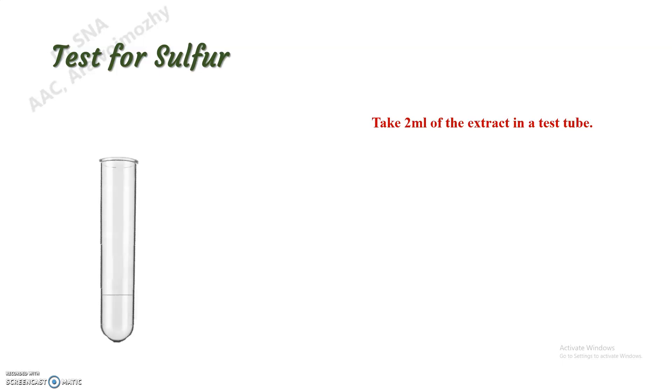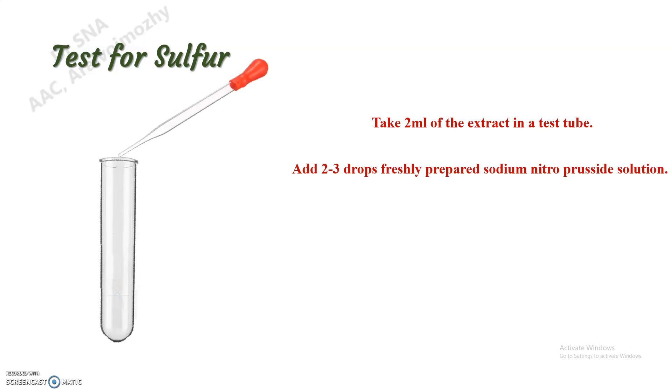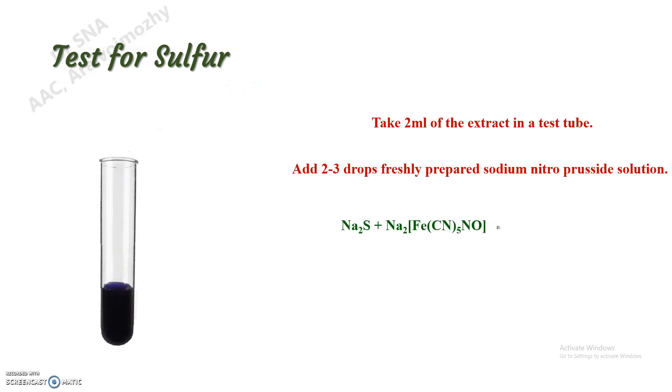Add two or three drops of freshly prepared sodium nitroprusside solution and we can see a violet color. That is due to the formation of sodium thionitroprusside, which indicates the presence of sulfur in the particular compound. Thank you.